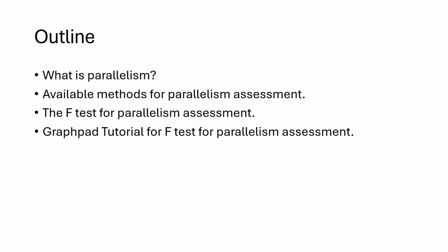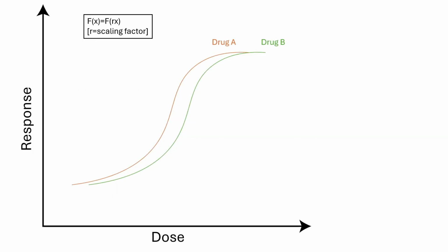In this tutorial, we're going to learn about parallelism and how to run a parallelism test in GraphPad Prism. If you're here just for the GraphPad tutorial, please skip ahead to the last section. Let's start with what is parallelism and its applications.